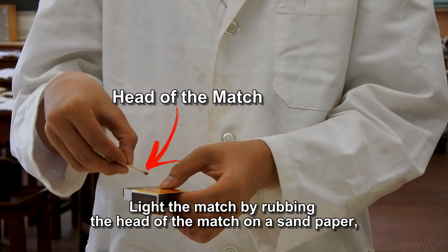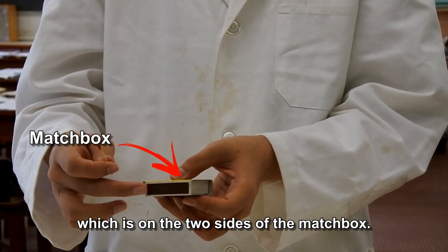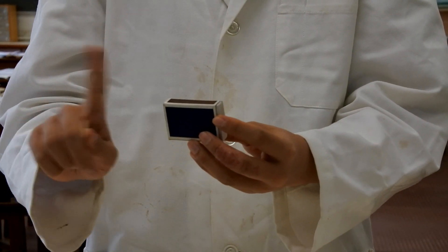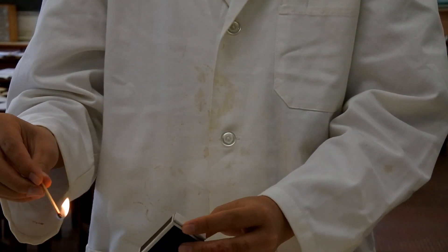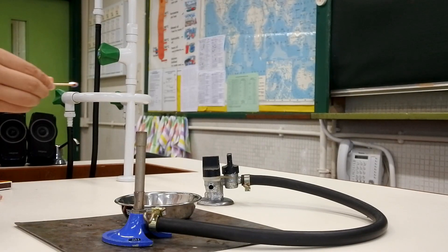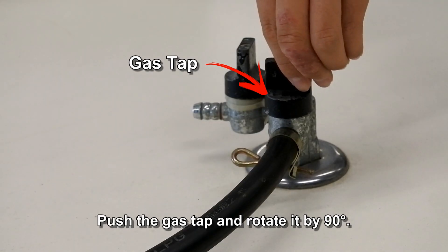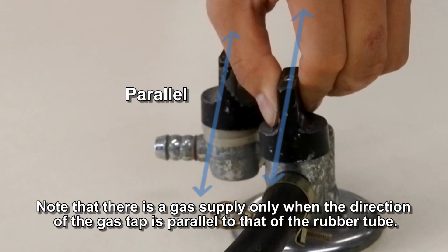Light the match by rubbing the head of the match on the sandpaper on the two sides of the matchbox. Put the lit match above the top of the chimney of the Bunsen burner. Push the gas tab and rotate it by 90 degrees. Note that there is a gas supply only when the direction of the gas tab is parallel to that of the rubber tube.